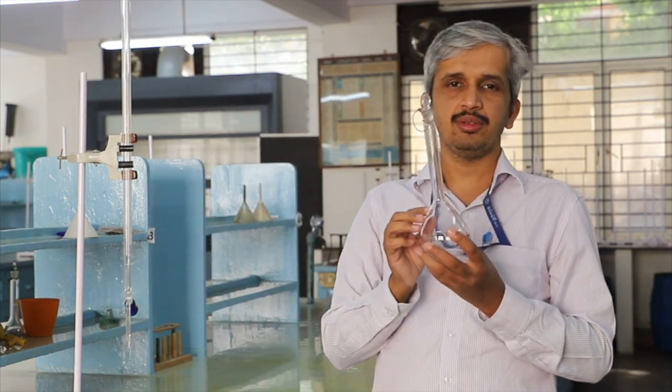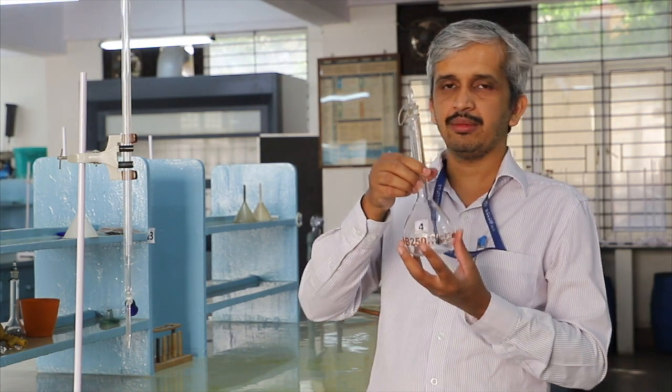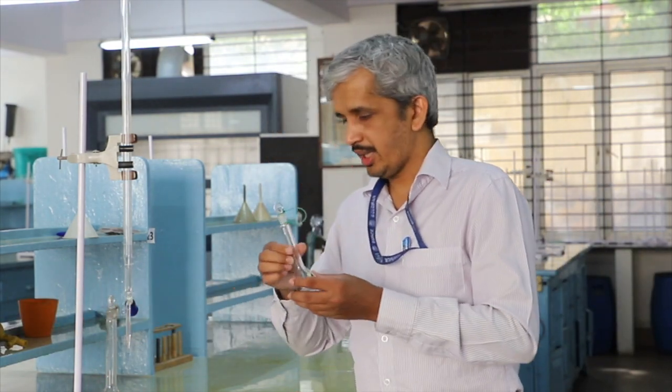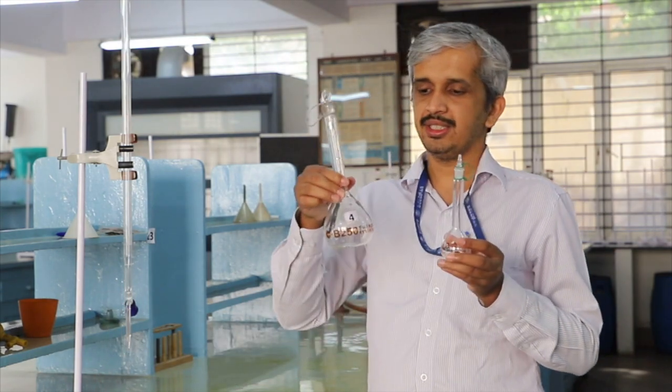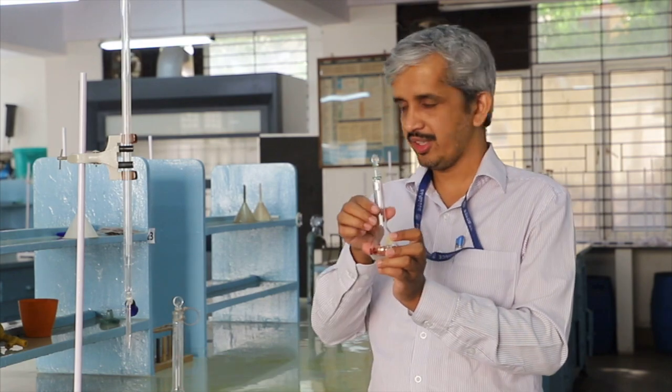Standard flask is used to prepare standard solution. It's also called volumetric flask. In this one can prepare standard solution of solute. Then of course you can have standard flask in different sizes. This is a 250 ml standard flask, and this is a 50 ml standard flask.